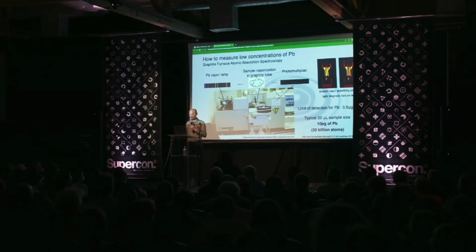There's one other really cool trick I wanted to talk about with this machine. You can imagine that if you vaporize this little cloud of atoms and you're doing this light absorption trick, there's all kinds of other things that are going to interfere with you. Water vapor, dust, you're burning this stuff at white hot temperatures, so there's going to be smoke in there.